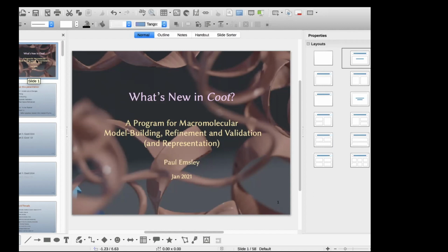Well, okay. I don't have strong feelings. So, as well as the model, we can export the map as well. The way I've been doing it currently is as a solid surface, which in Blender you can make transparent. And maybe that's the way to represent structure, to represent the combination of model and map.